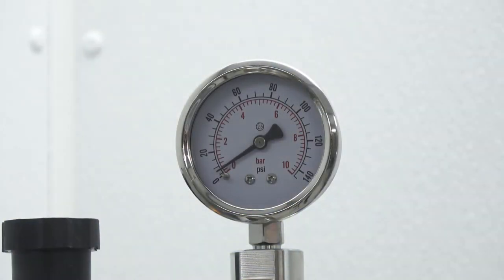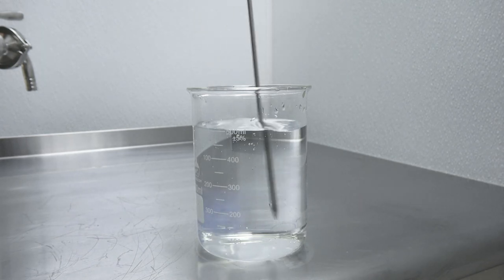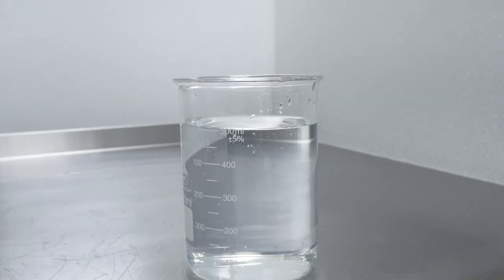When all of the emulsion is filtered, we observe an increase in the housing pressure. With a volume-weighted average particle size in the 25 to 30 nanometer range, the emulsion goes into water clear and has excellent stability. The emulsion is suitable for infusing beverages, shots, tinctures, gummies, and syrups, and can also be dried to form a powder for solid dosage applications.